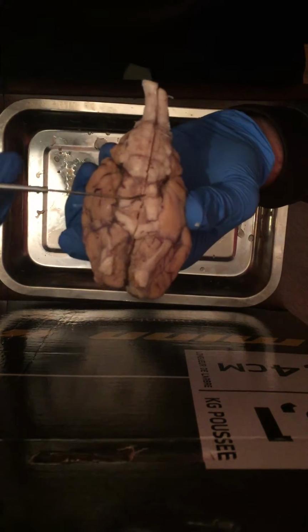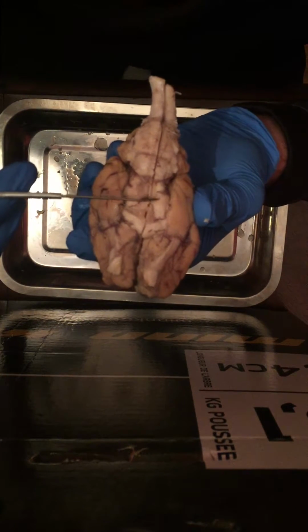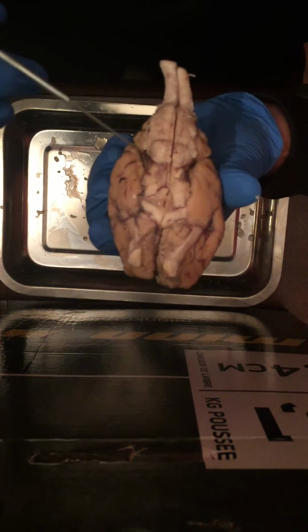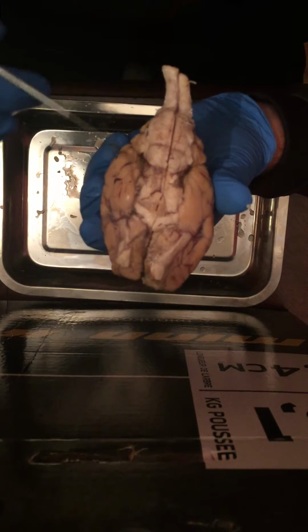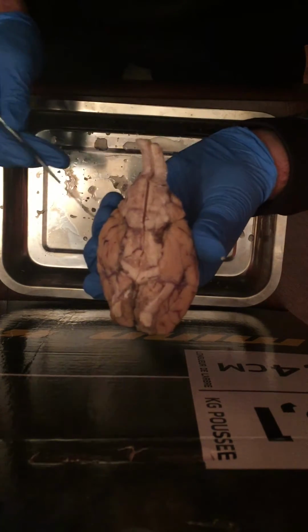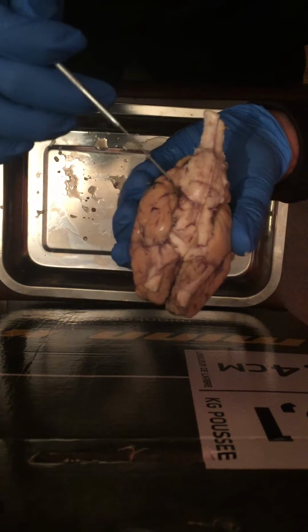The oculomotor nerve is supposed to be right here, but I can't seem to find it. So this is the oculomotor nerve here. And then the trochlear nerve is directly above and to the right of the pons.